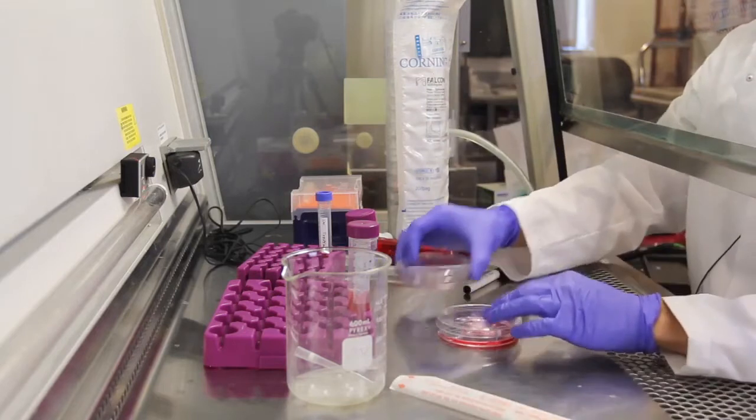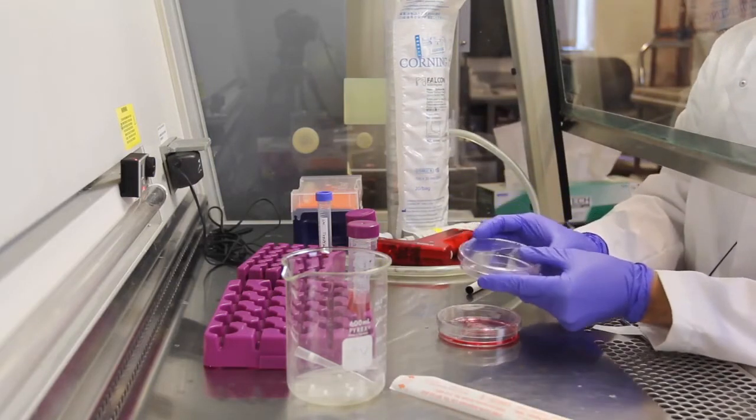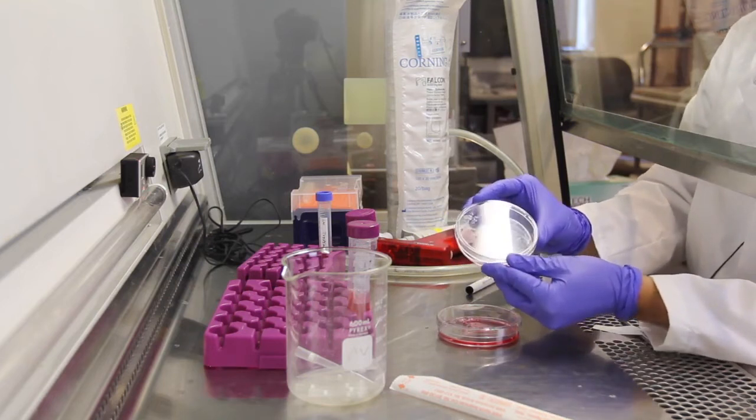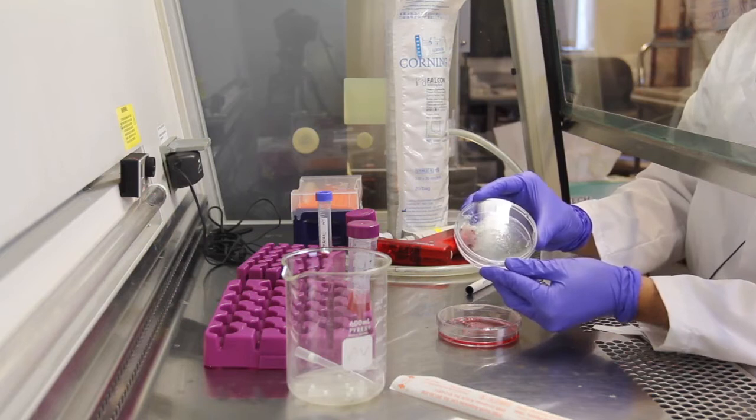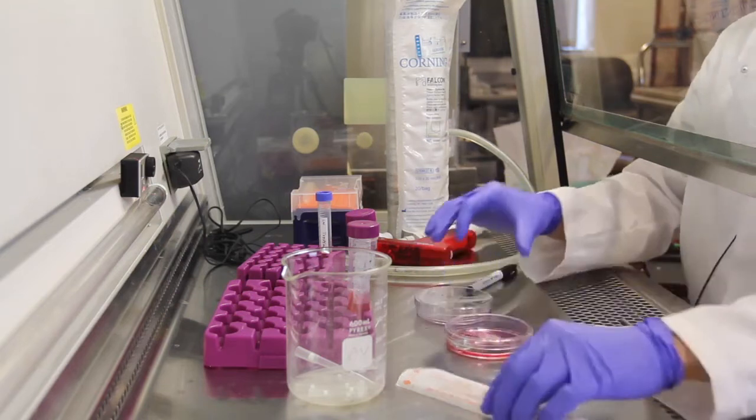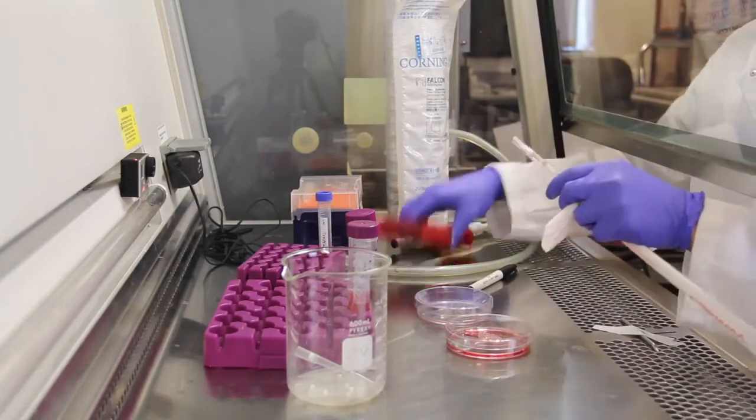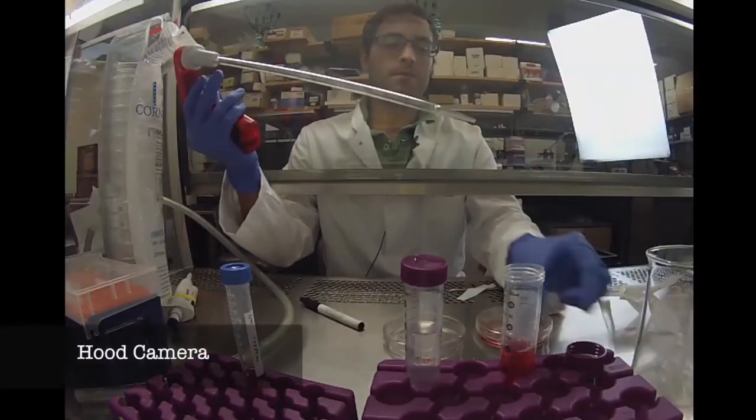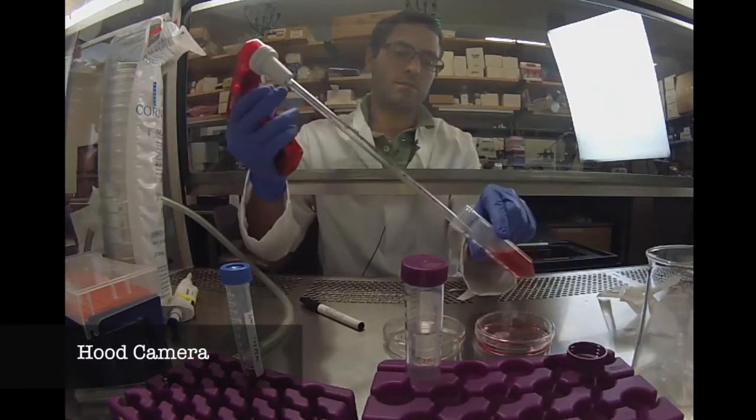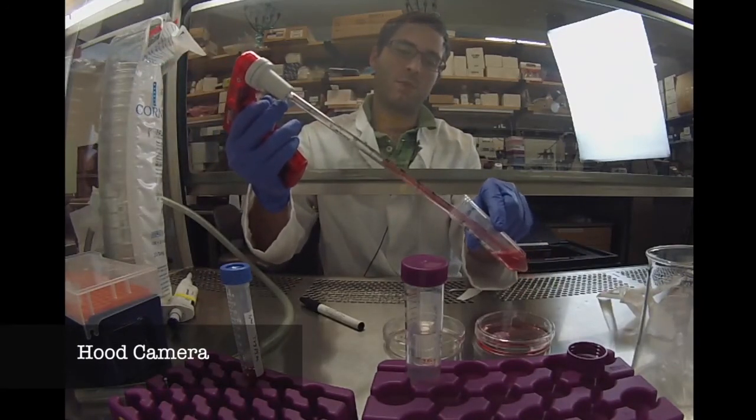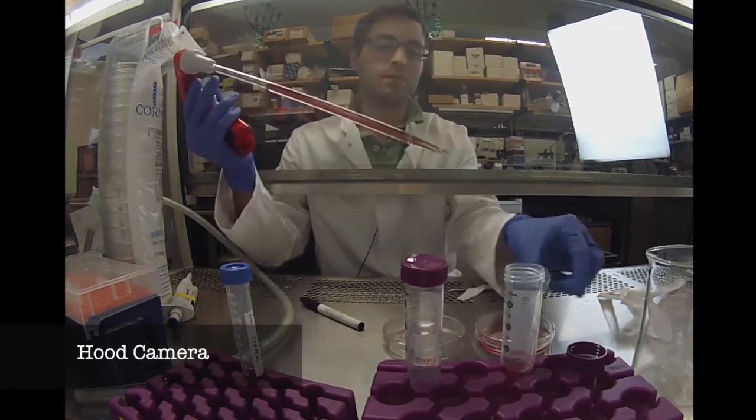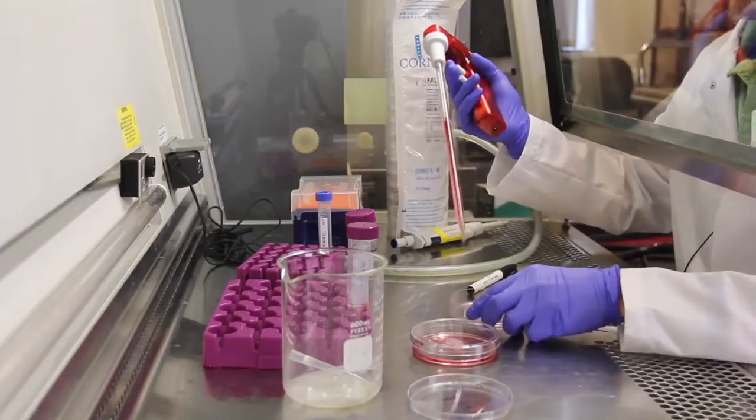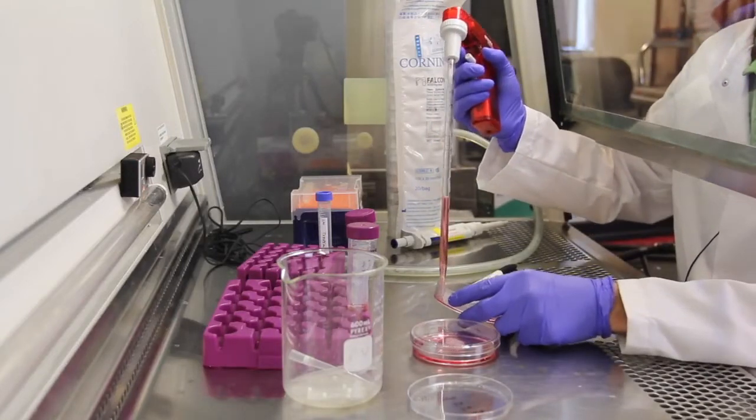And at this point the trypsin will have done what it needs to do. One way to test for that is to gently tap the side of the plate and you can start to see the cells sliding down toward the bottom. To get them back to their original concentration, I take 9 more milliliters of growth medium and pipette that onto the plate.